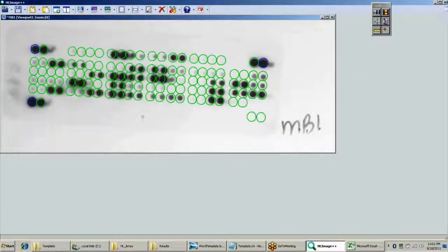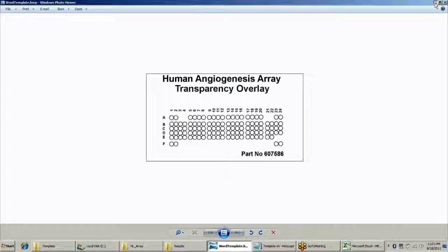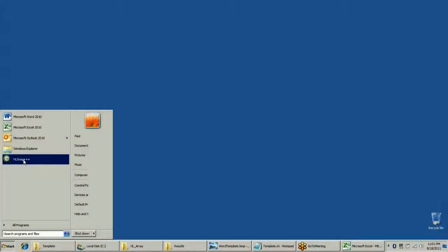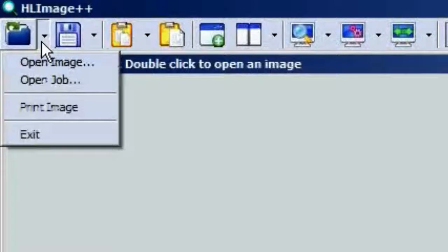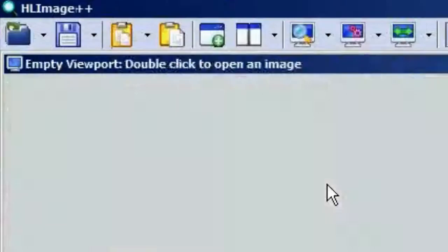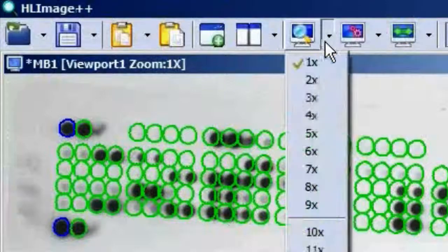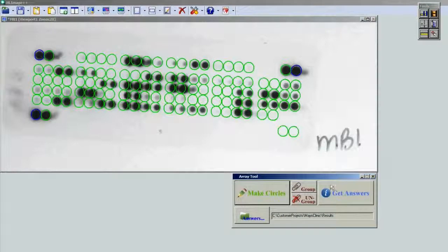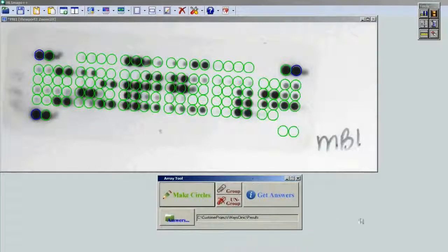Next time, instead of doing all that work again, simply open the job that we just saved. Zoom it up and we're back to where we left off. That is how you use the Array Analysis tool for HLImage to analyze your arrays. If you have any further questions, please contact support at wvision.com for further help.